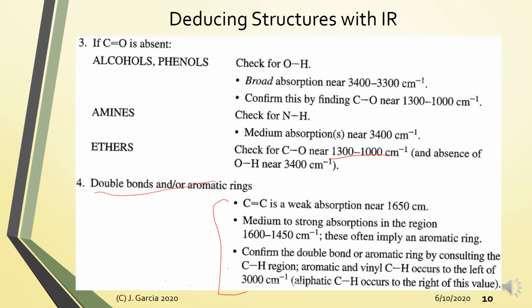Okay, kung carbonyl derivative yan, so aside from the 1700 strong intensity peak, you would also look for these particular signals, especially for aromatic. Yung aromatic, hindi rin makita yan. Especially in presence ng overtones. No? Yung overtones, yung parang tatlong kambal na peaks, no? With weak intensity peaks. Usually can be found a little bit above 1800s. No? Those na makikita usually. So it's indicative of aromatic rings.